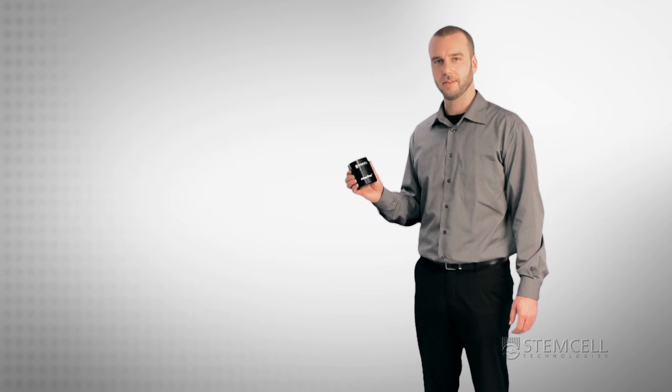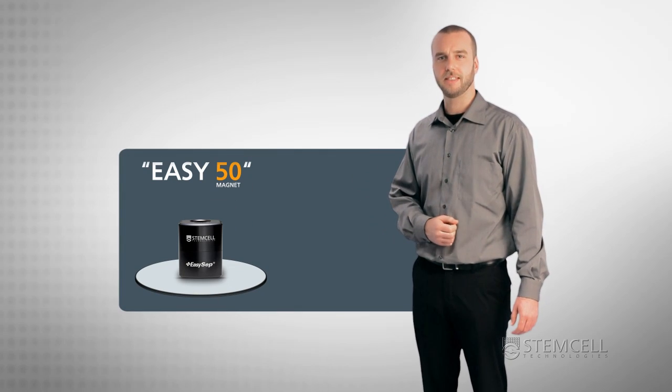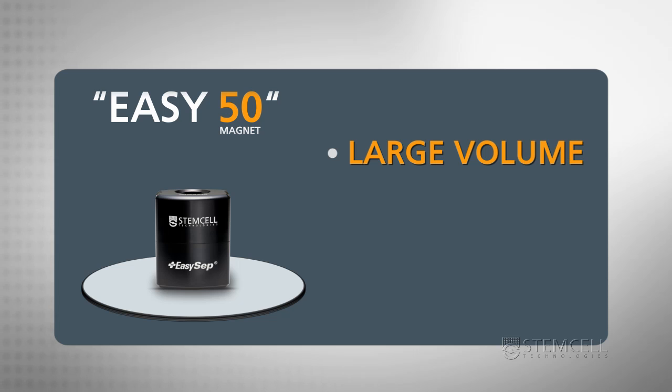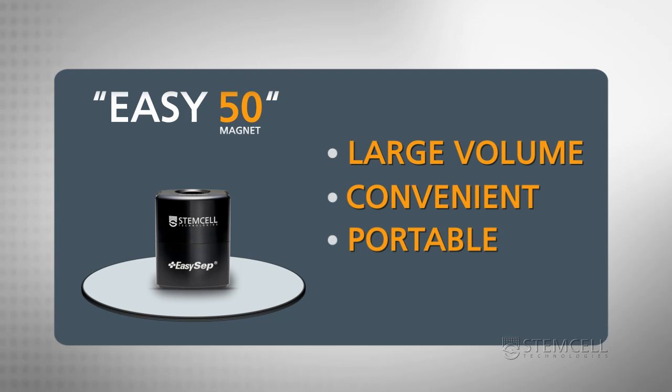Current approaches to large volume separations involve large and cumbersome magnets and columns. The EZ50 magnet is so small it fits in the palm of your hand. EZ50 is easily portable and takes up minimal space inside your hood, giving you the benefits of large volume cell separation without the inconveniences of a large size cell separator.